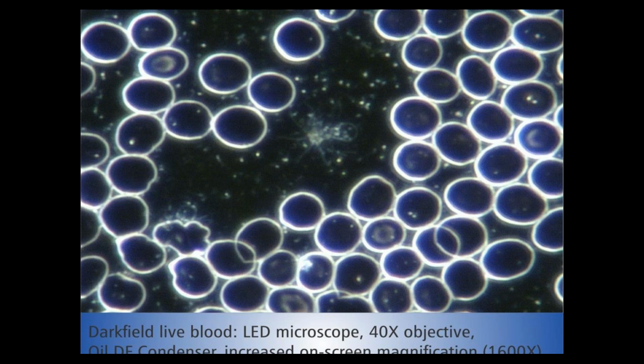Now, normal microscope systems are set up in such a way that the magnification that you get on the screen, so through the camera tube, is the same as the magnification through the eyepieces. Now, in most situations this makes sense, but in live blood analysis we actually need a magnification of at least 1,000 times on the screen when we're analyzing the blood.